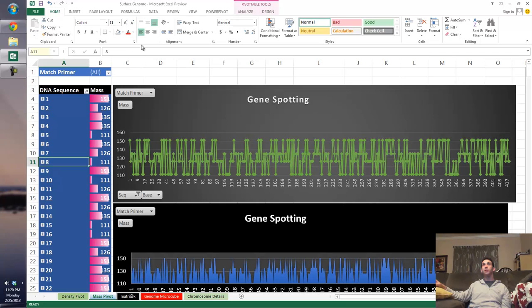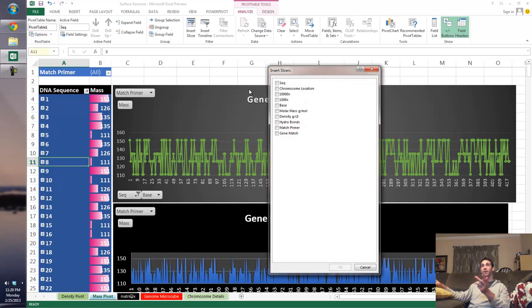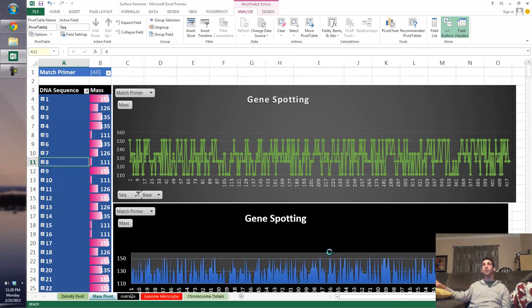You could do this with any gene, but the thing is repeating, and I want to know what it is. I want to know what chromosome it is. I want to know if it's human or something else. Somebody get a hold of Bill John and find out where he got this data. I hope I didn't send it to him. If I did send it to him, then it's chromosome 1 for the 2003 data. But I don't think it is because I've seen the Ns in here.